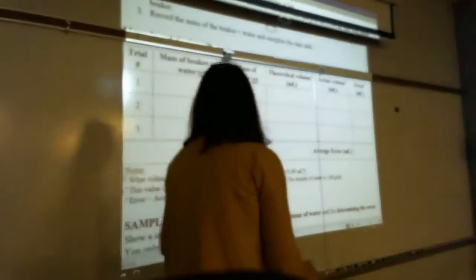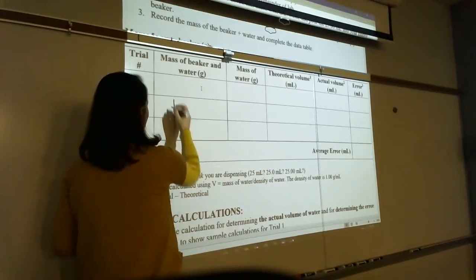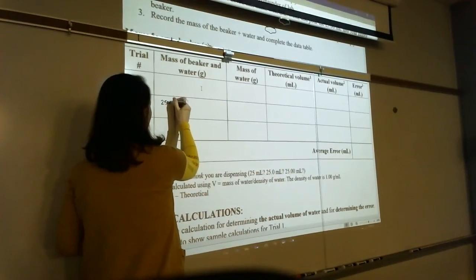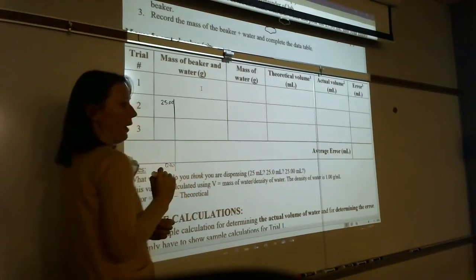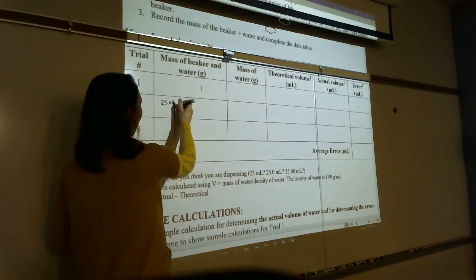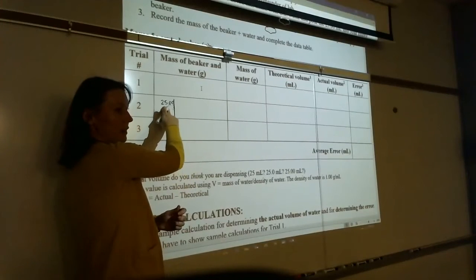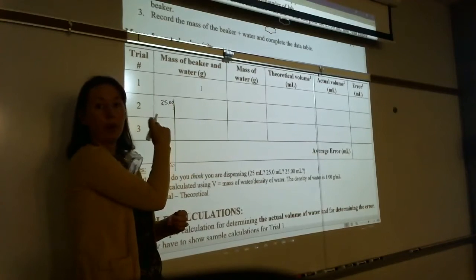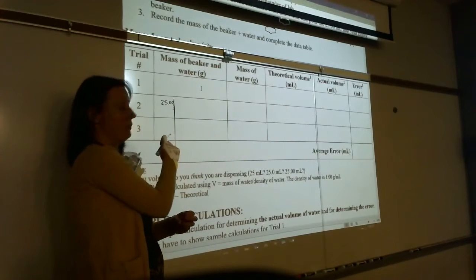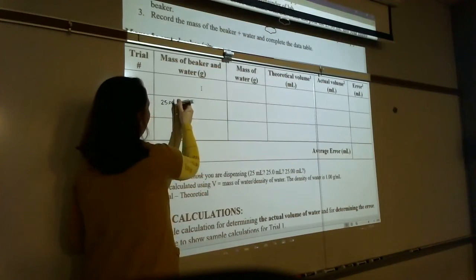But basically, it goes backwards. So when you're reading the volume of the burette, 25.00 is up here at the top, and zero is down here at the bottom. And these are in 0.1s. So you can get two decimal places from a burette reading. And I expect your data to reflect the number of decimal places you can get. And when you're reading your volume, just if you remember back to high school, you want to read from the bottom of the meniscus.